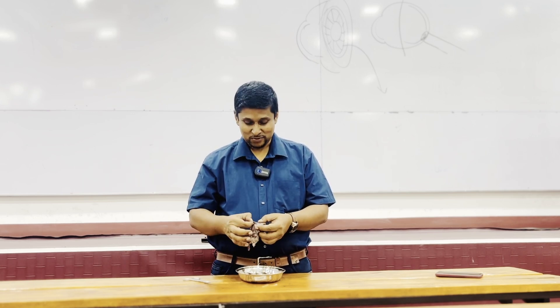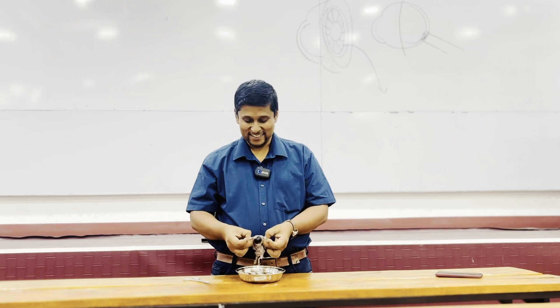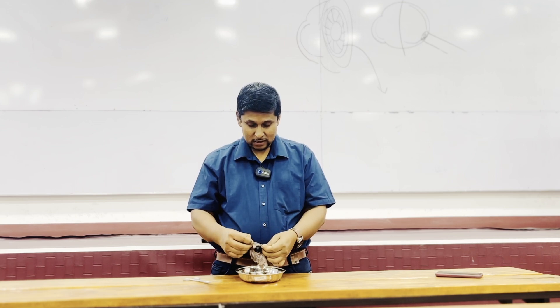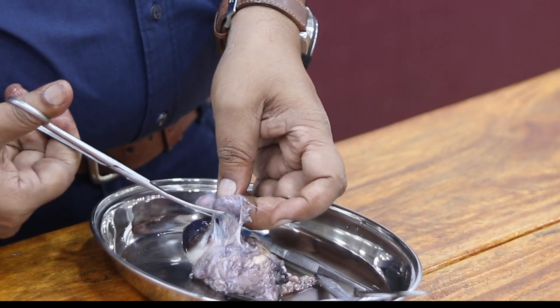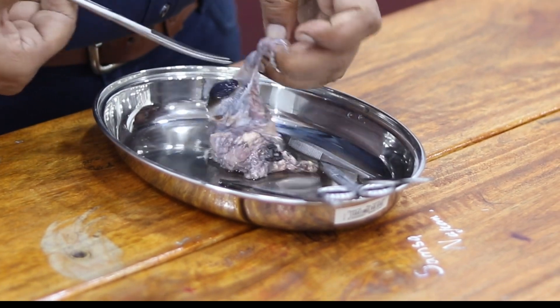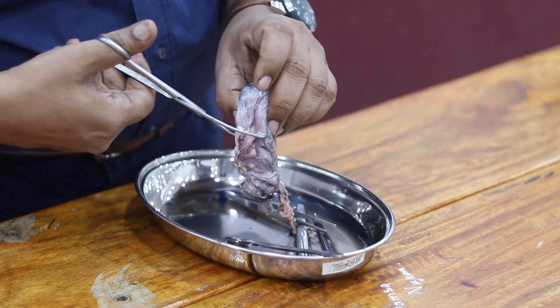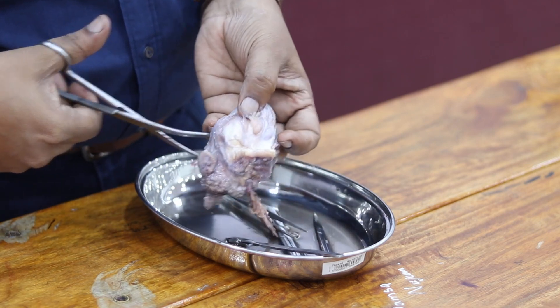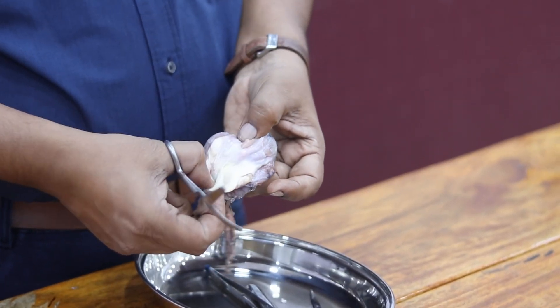We need to clean it a little bit to see the optic nerve. It's going to take some time and you need a little bit of patience. I'm going to cut and remove the extra tissues behind the eye. The eye is surrounded by fat tissues which absorb shocks and vibrations inside the eye socket.